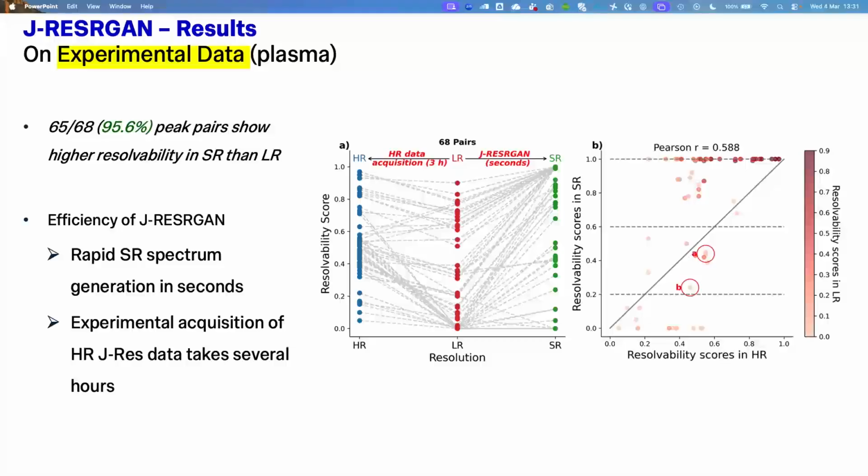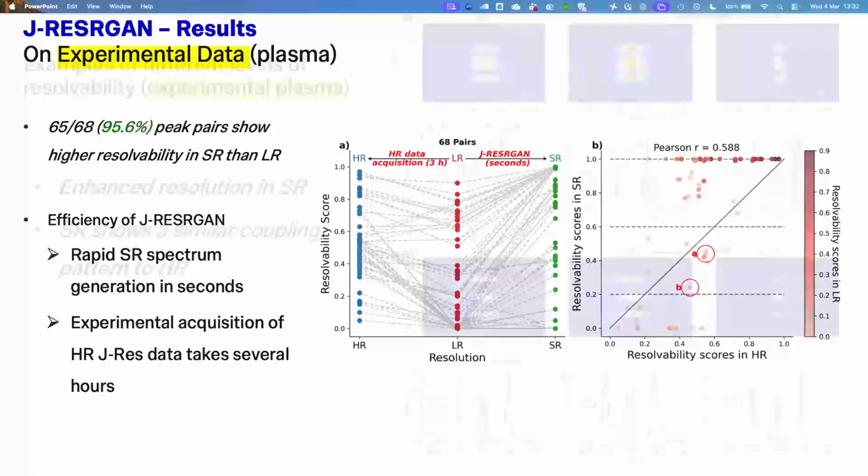huge amount of time. In metabolomics, I didn't mention, but we're typically running hundreds or maybe even thousands of biological samples on these spectrometers. So if we can cut the time by a factor of 5 or 10, that will really make a huge difference in what we can practically do with a big study of many people and clinical applications, for example.